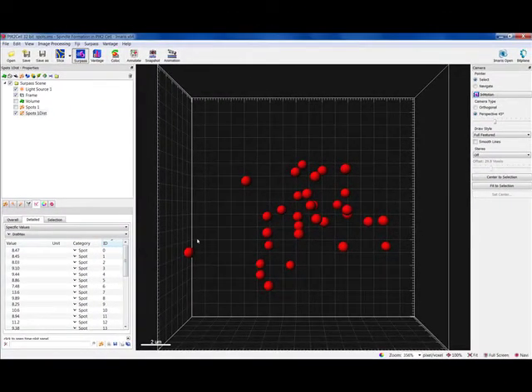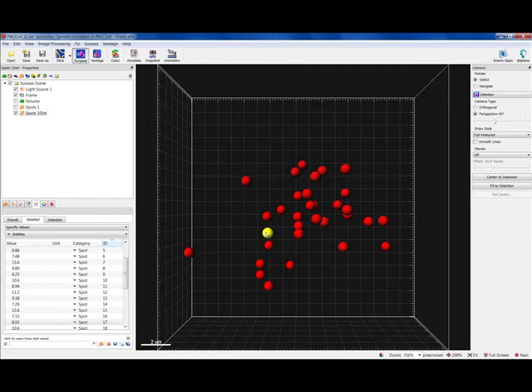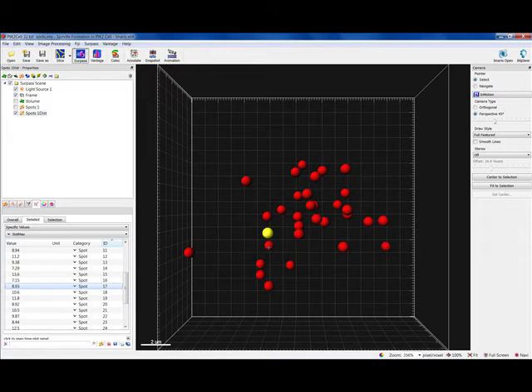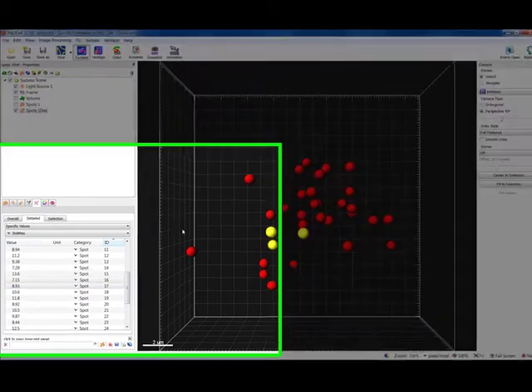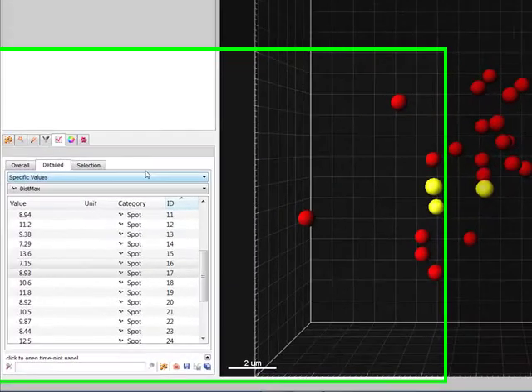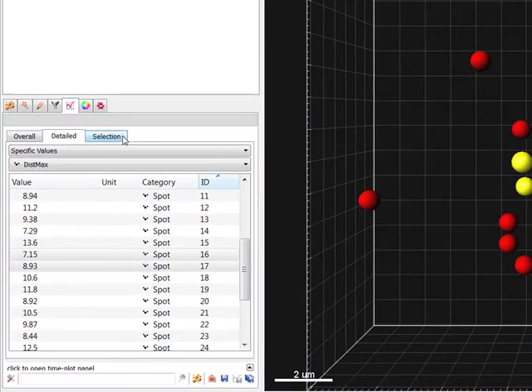Click directly on the object of interest and the corresponding row of the table is highlighted. To find all statistical values only for the selected object or group of objects, choose the Selection tab.